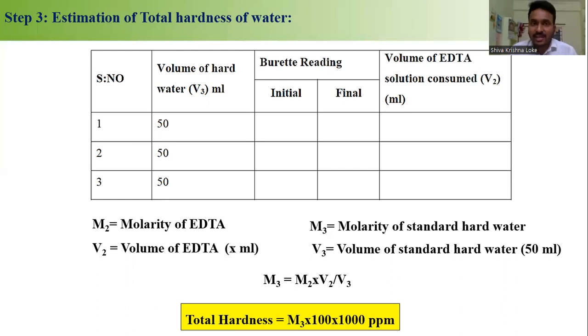If we titrate the given water sample against disodium EDTA in the presence of Eriochrome Black T as an indicator and buffer as an additive, which restricts the pH, because Eriochrome Black T is a pH sensitive indicator, that's why we add a buffer. Due to this reaction, we first get a metal-EBT complex which appears wine red in color. After continuous titration between EDTA and the given water sample, finally it appears blue.